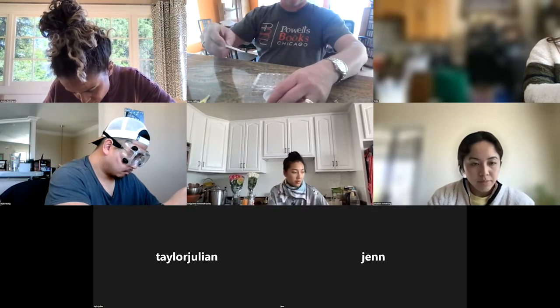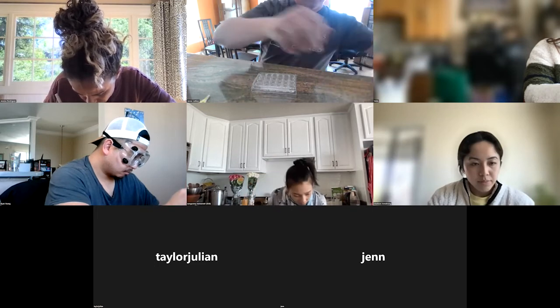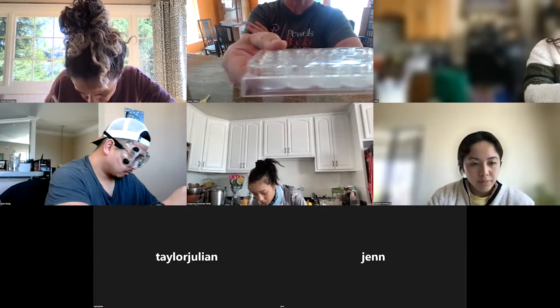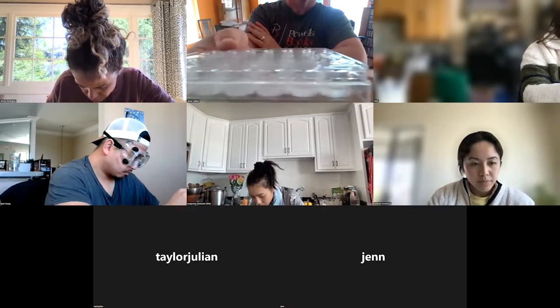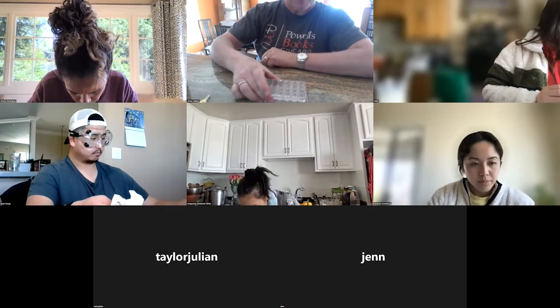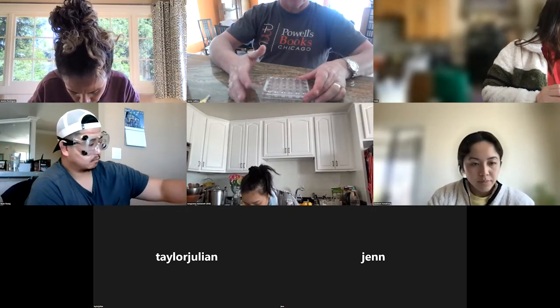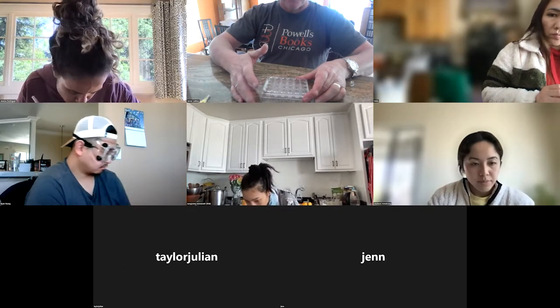Okay. So you can see as you go across, it gets a lot more dense. So it's fairly easy to see which direction that's going. And you just sort of tap the plate to get it mixed.